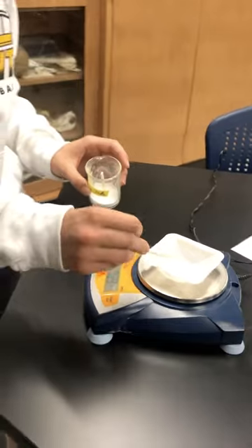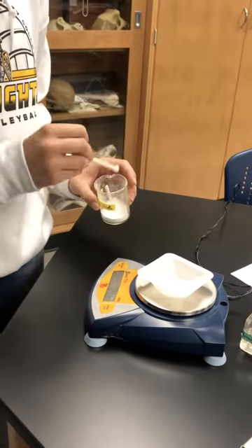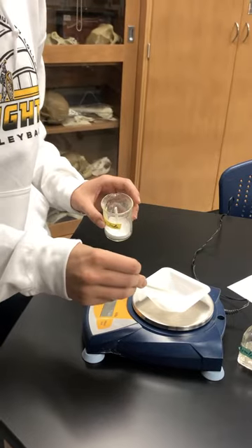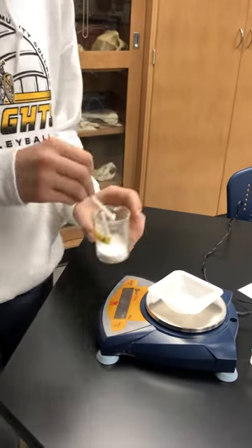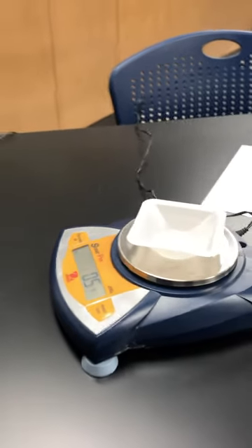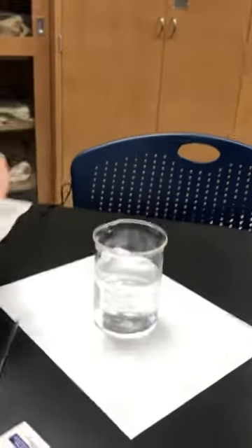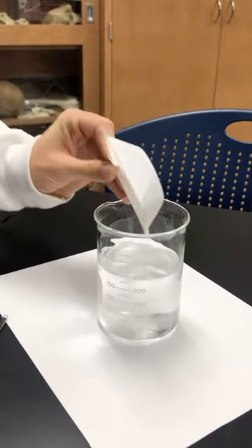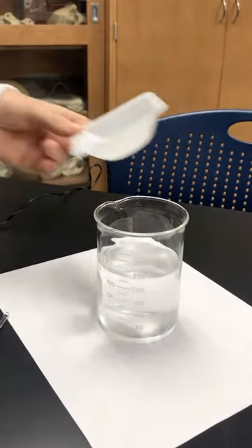So she's going to get it at 1/2 gram or 0.5. And then what she's going to do is add that baking soda to 250 milliliters of distilled water. So as you can see, she has it exactly at 1/2 gram. She's going to add it to this beaker, which is 250 milliliters of water.